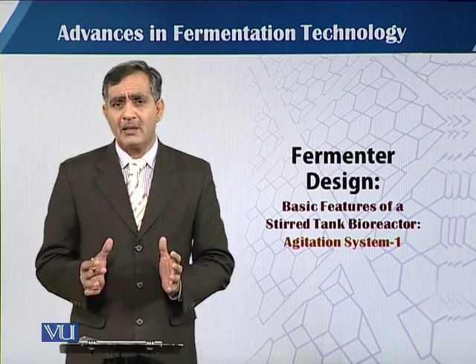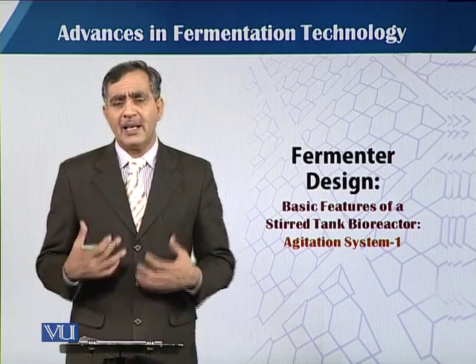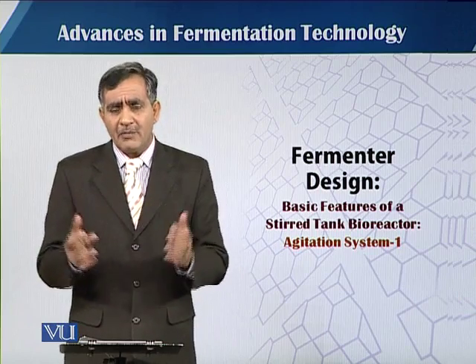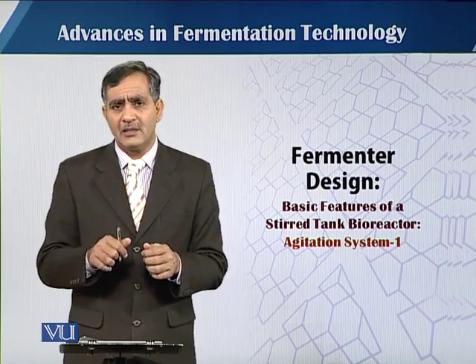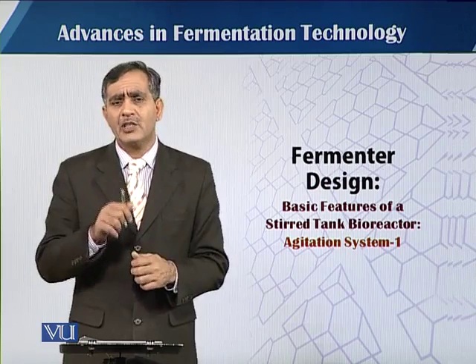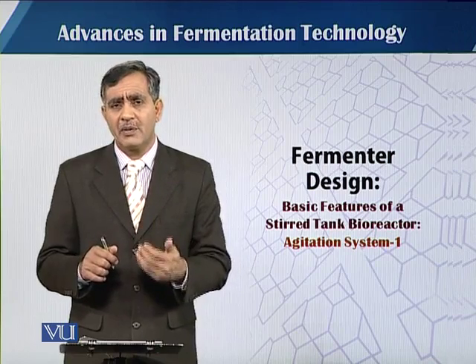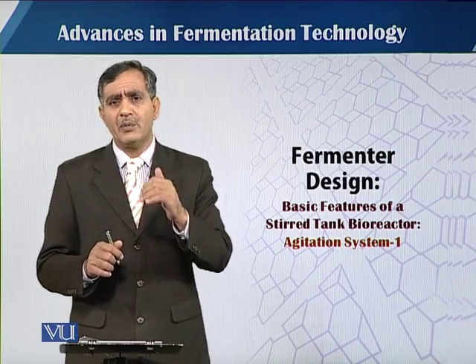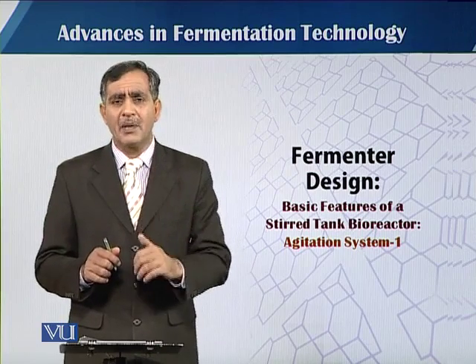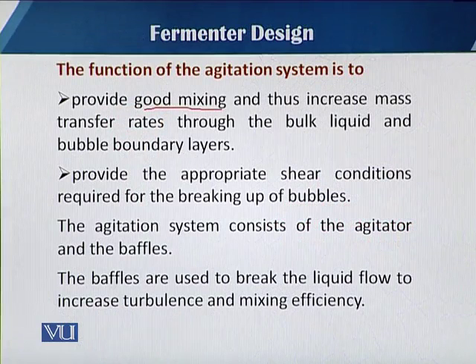So the body vessel of the fermenter is like our main body, to which the arms, head and legs are attached. In the same way, the fermenter or body vessel is the main part, and then there is an agitation or agitator system attached to the body vessel. That is a very basic component of a stirred fermenter. As the name indicates, stirred. The stirring is needed because when we have to run our fermentation process in submerged cultivation, there is a need of stirring. So you can see what the function of the agitation system is.